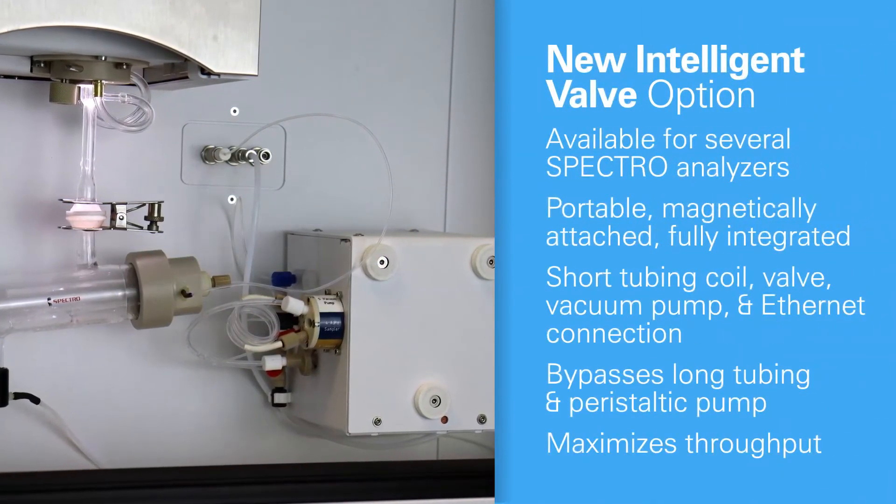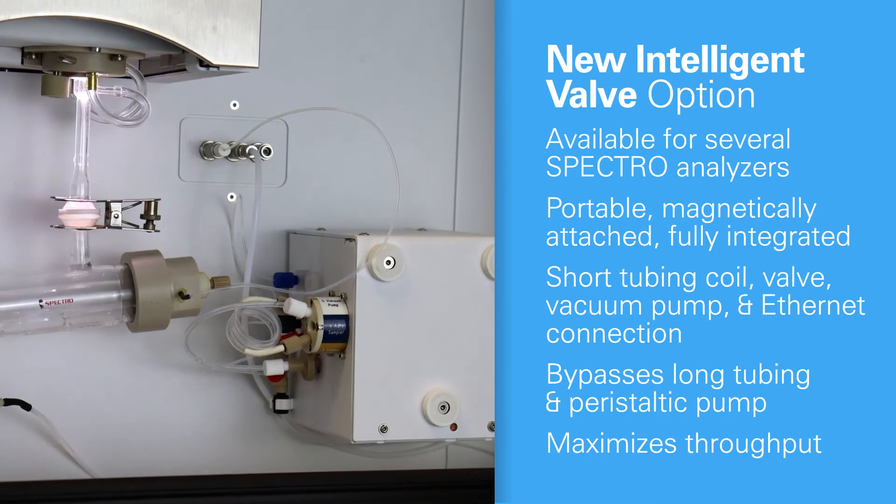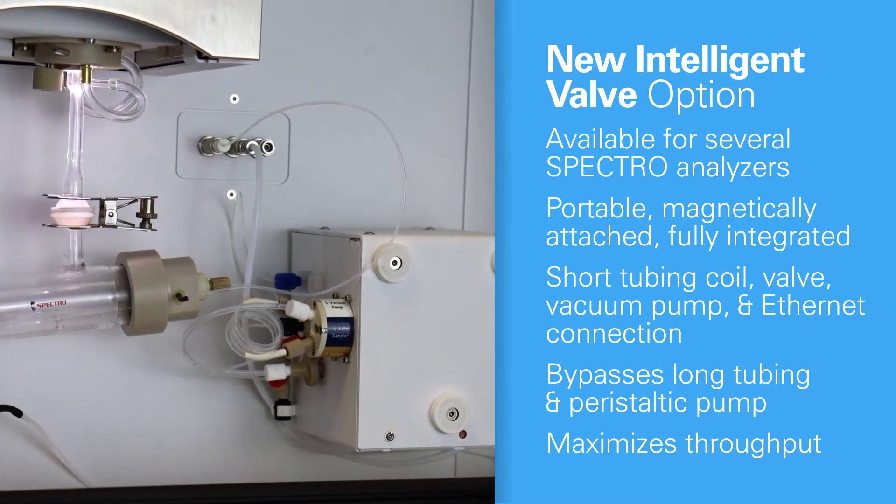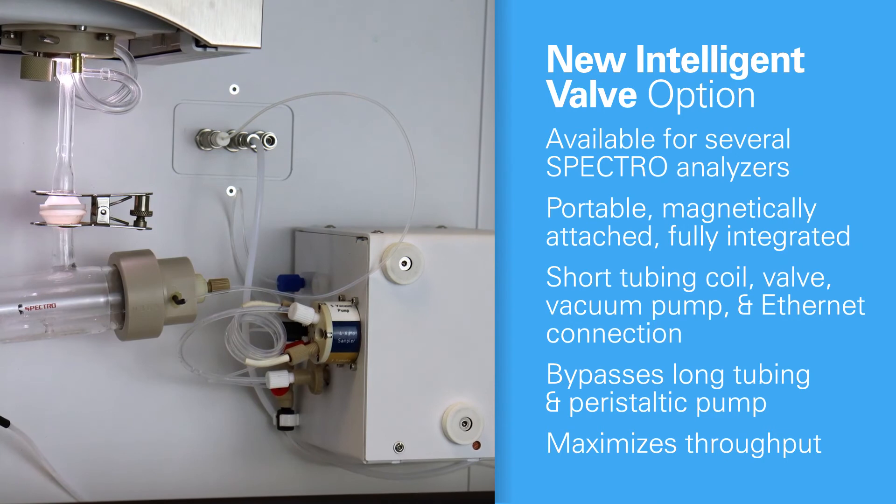Or, for the highest productivity, bypass the pump with our brand-new intelligent valve system. Just hook it up between your test tube and nebulizer.